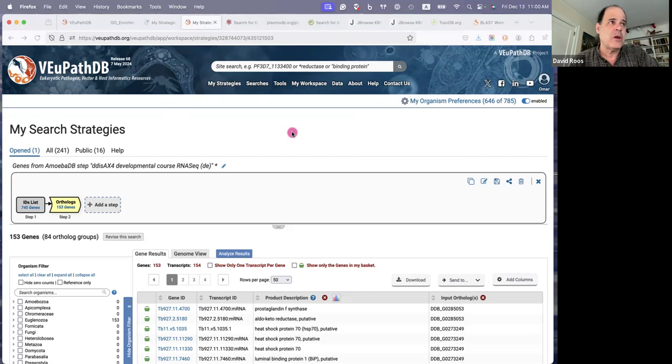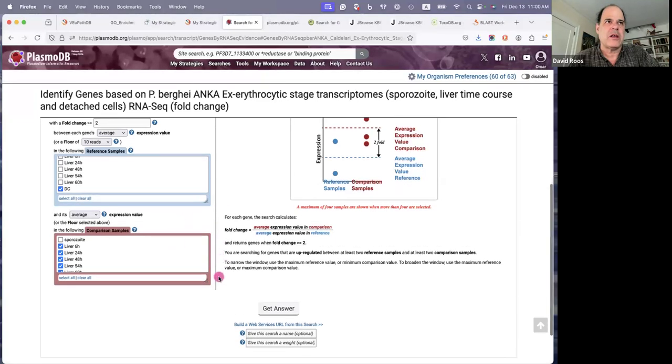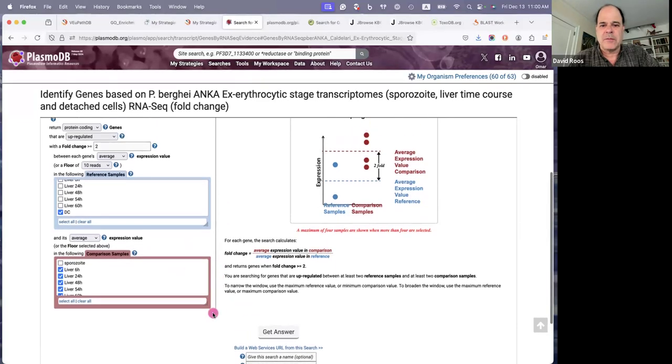You can also compare results from different searches. In my group, I was walking through the first of the expression profiling exercises, running a query based on the differential expression that allows me to define p-values. In that exercise, I was also asked to run a separate query using the fold change queries.